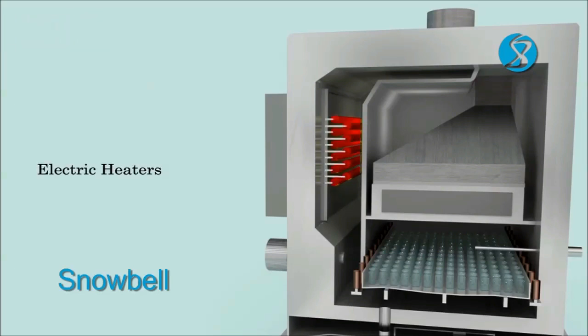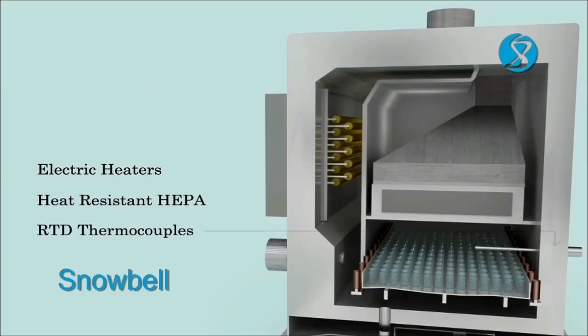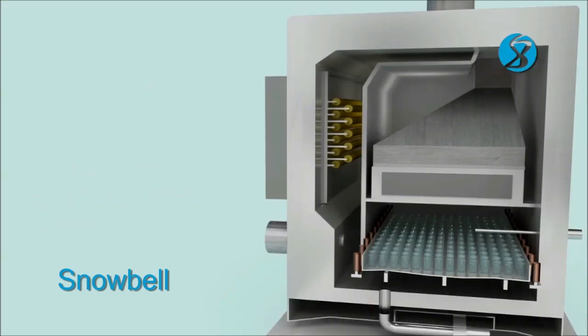As the vials are near the sterilizing zone, they are preheated up to approximately 100 degrees centigrade by the hot air of the sterilizing zone. This air, along with water vapor, is pulled out from beneath the conveyor belt at the beginning of the sterile zone by drying zone extraction blower and ejected out of the system.